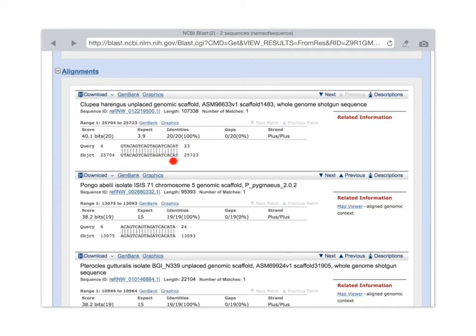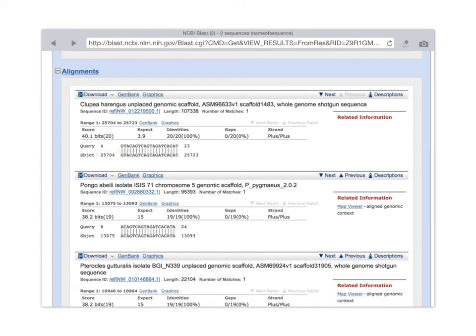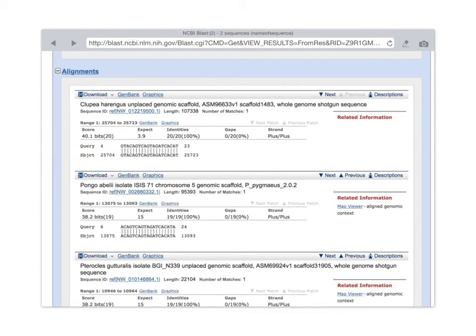However, note that this match doesn't start at query nucleotide 1. So we are missing nucleotides 1, 2, and 3. The first three nucleotides that I typed in aren't matching whatever the first three nucleotides here in the Clupoea herringus genome would be.